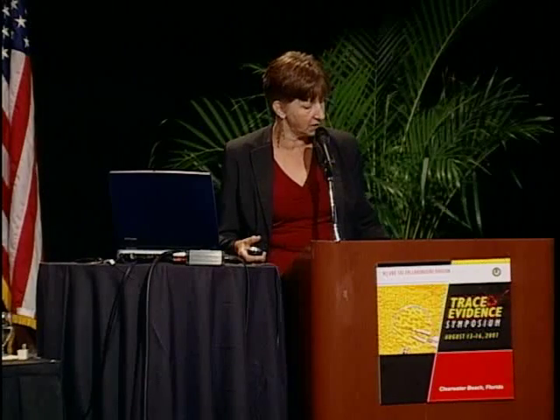Another thing I observed in the lining of this pair of jogging pants was something I called bridging yarns. It seemed like where the fabric had been tucked, folded under, the blade was able to cut right across the surface of the fabric while leaving the underlying folded portions of the fabric undamaged. This picture shows the glass that was found in the pocket formed between the lining of the pants and the outer surface of the pants, and in with the glass, a couple of the little pieces of fabric that were cut out.